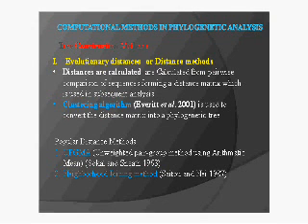Yesterday we have seen, okay, we have generated a file. Now today we are going for the actual phylogenetic analysis. The data given by ClustalW was a dendrogram. You just observe that, but it is just a crude phylogenetic analysis. We need to go for a further analysis. Further means we want a replication of the data, and then we can generate a number of trees, and out of the number of trees we need a tree which satisfies our criteria. So that is the purpose.